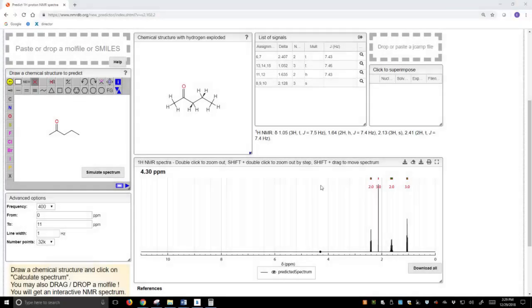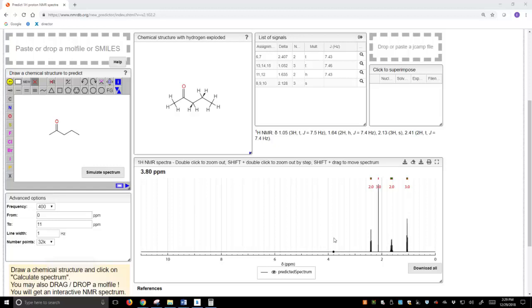Here's our molecule again, it's over on the left. Very simple structure, and I've simulated this spectrum at a frequency of 400 megahertz, and I want to zoom in on just one of these peaks and we're going to analyze it using this idea of coupling constants.